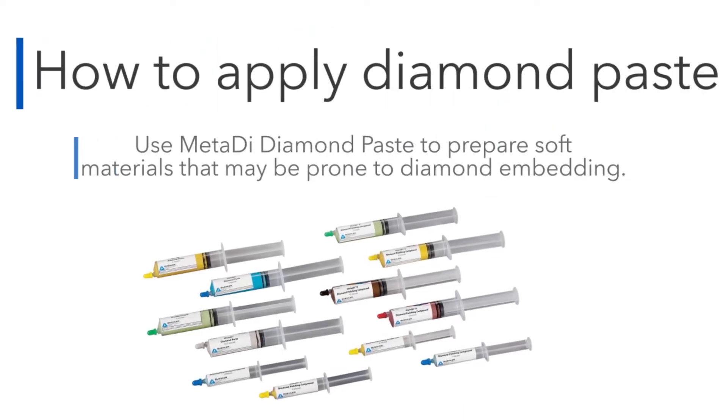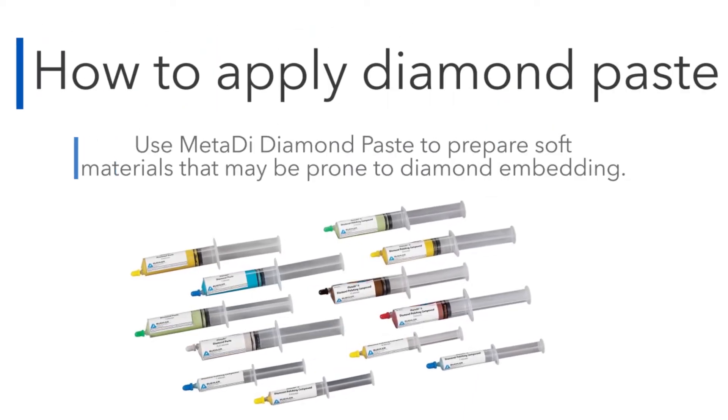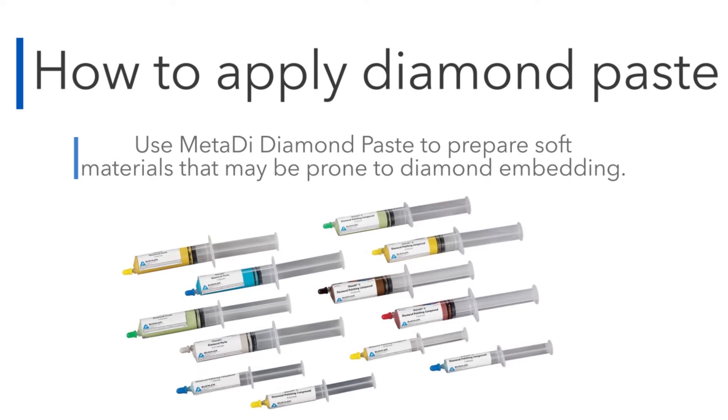Welcome to Buehler's how-to video on applying diamond paste. Use MetaDi Diamond Paste to prepare soft materials that may be prone to diamond embedding.